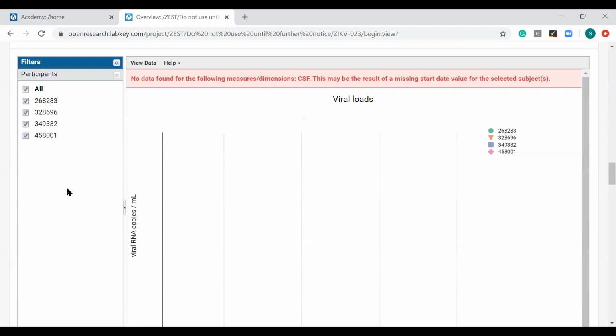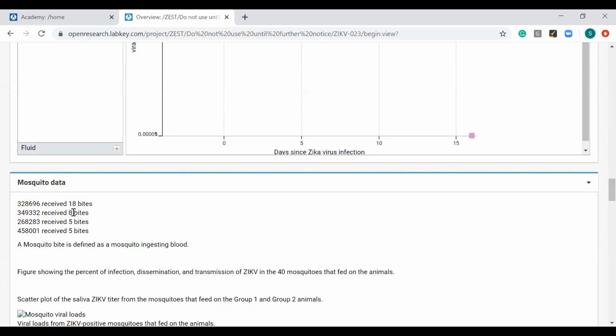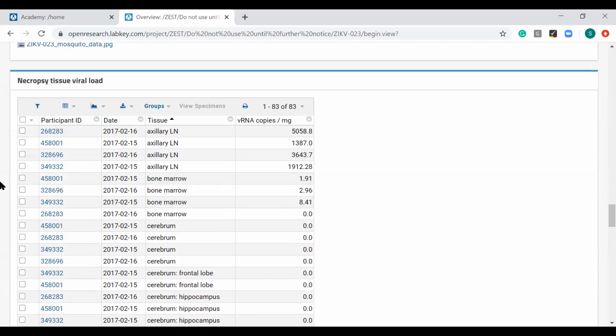This one is, frankly, there are some kind of broken things inside of this portal. It's a very raw portal. The Open Research Portal really is a mix of finished and unfinished research. And so you'll see some stuff that's halfway done as you surf through this portal. And I really recommend you do so. This is publicly available. There's lots more to see than just this one portal I'm looking at.